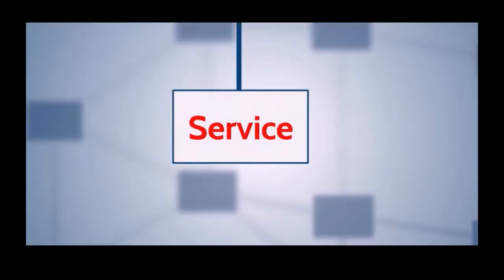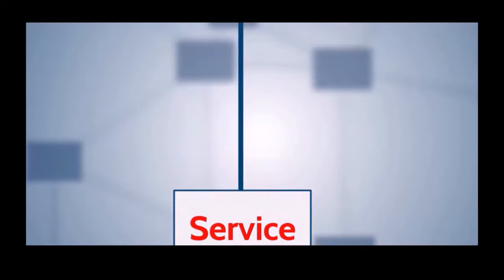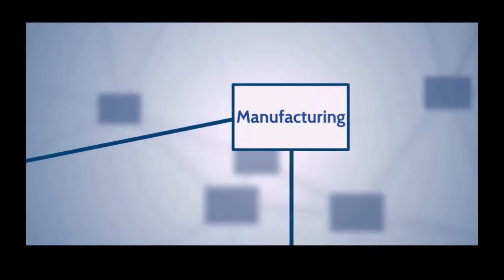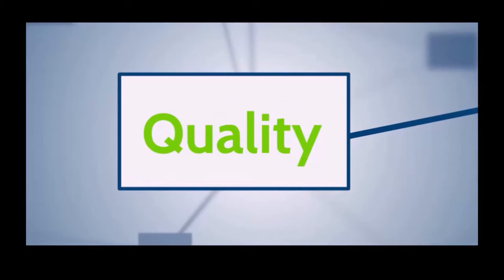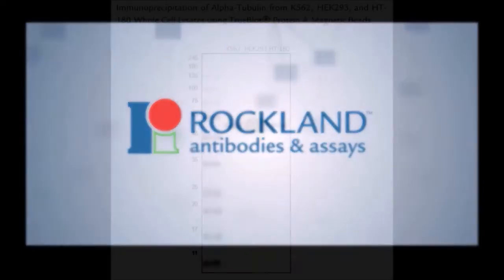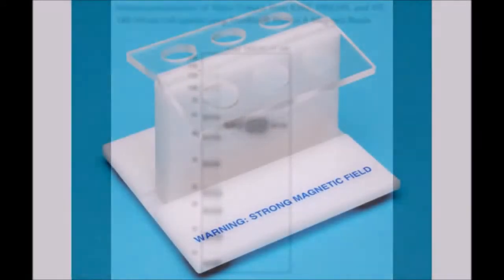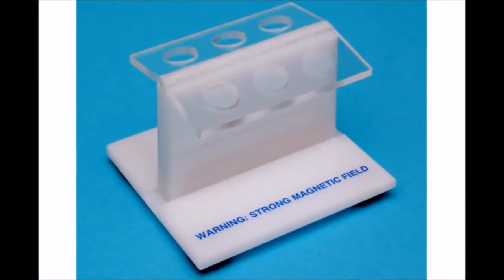Rockland's TruBlot magnetic beads allow highly effective and efficient immunoprecipitation of an antigen using smaller amounts of antibody. These beads are specifically designed, tested, and quality controlled for isolation and purification of antibodies, and immunoprecipitation methods using manual or automated platforms. In this video, we will briefly show you how to use protein A or protein G conjugated magnetic beads for immunoprecipitation experiments.